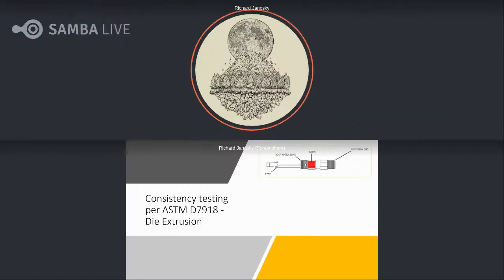Thank you very much for that introduction, and welcome everybody to Greasy Thursday. We'll be talking about consistency testing per ASTM D7918, so our die extrusion method.